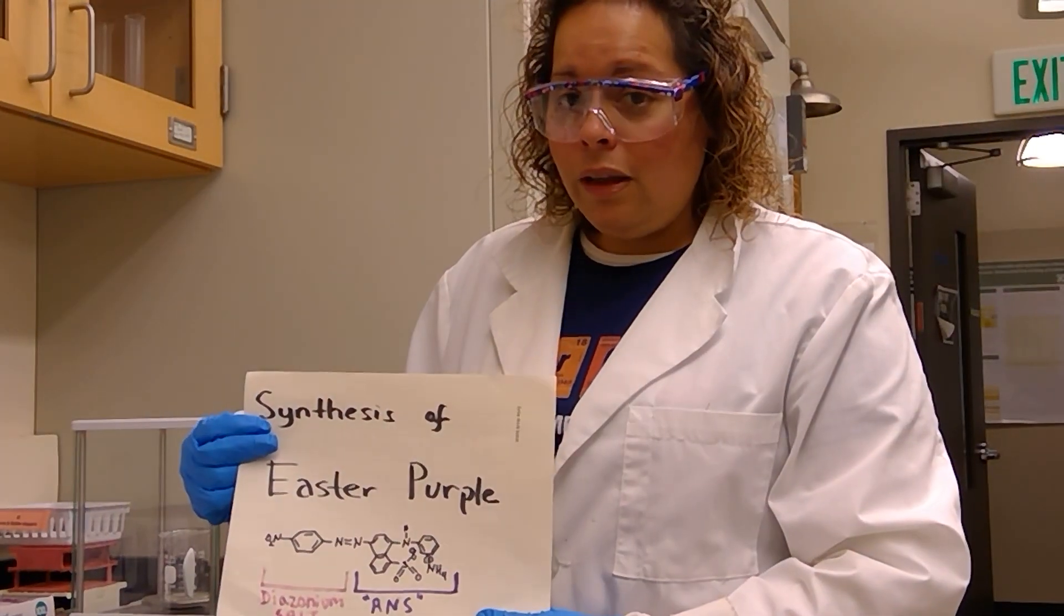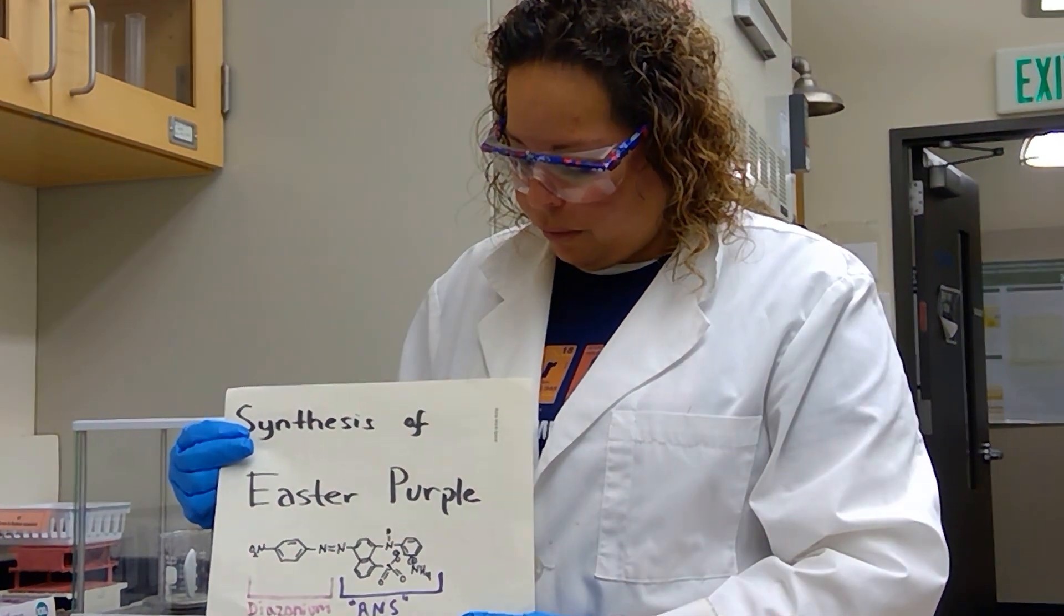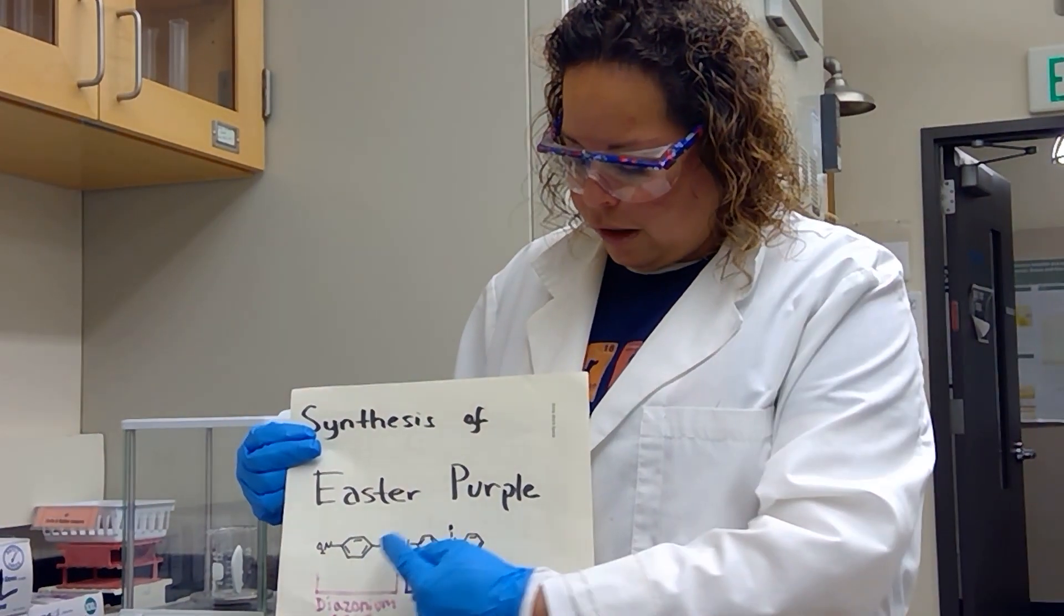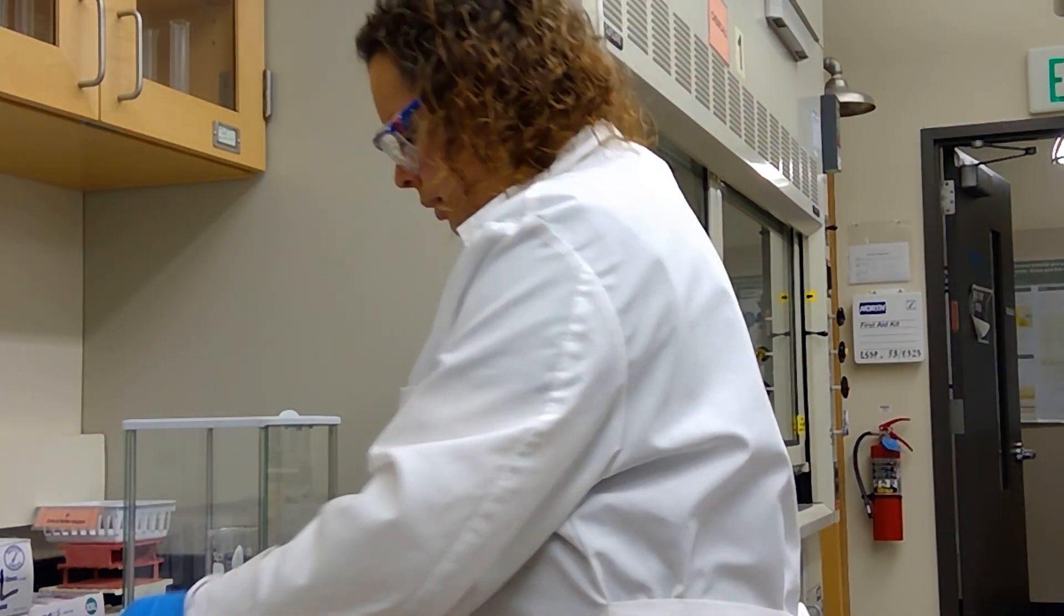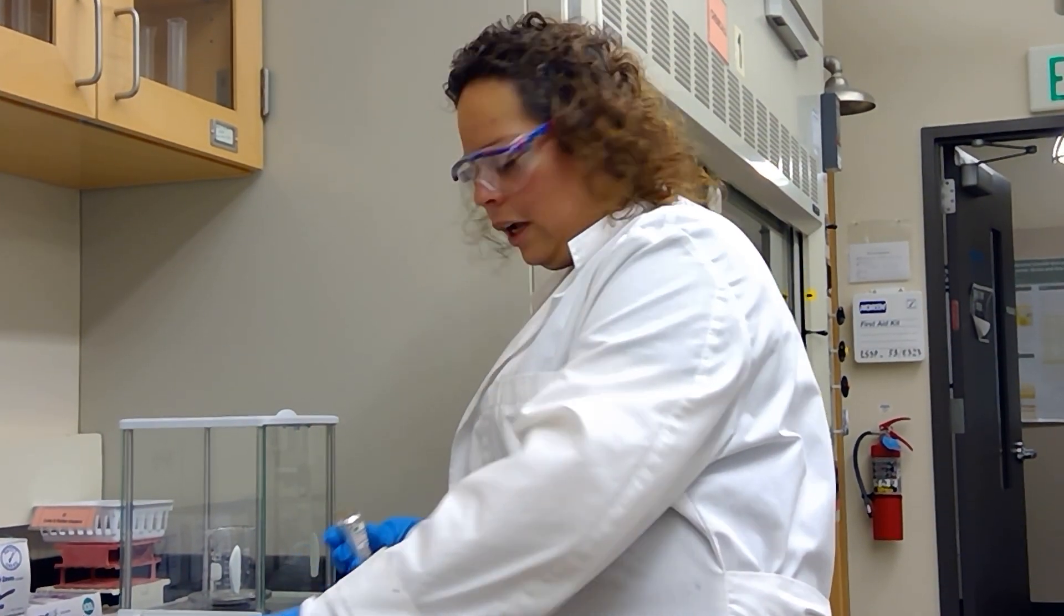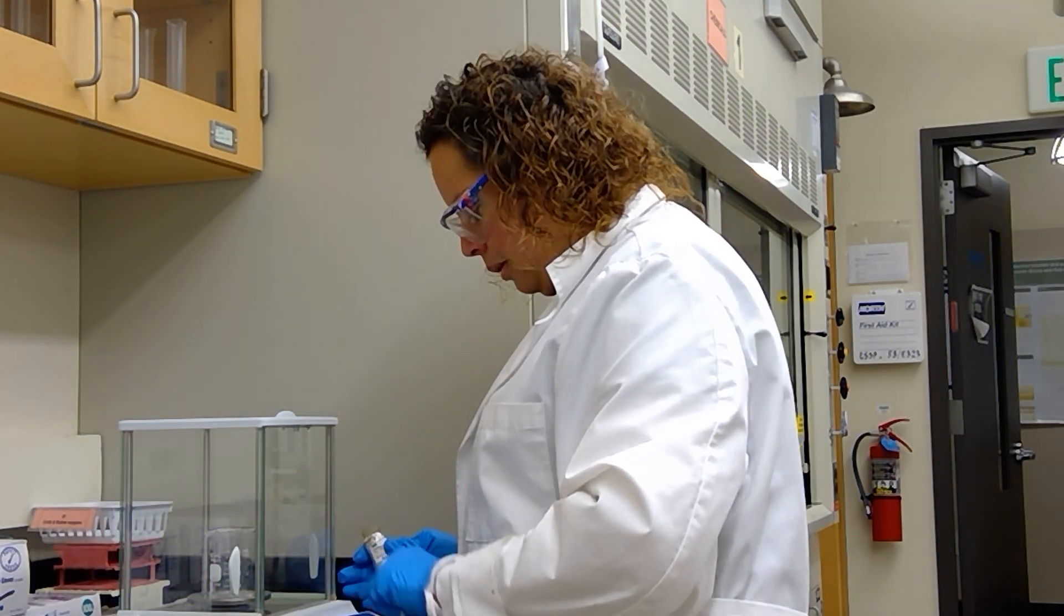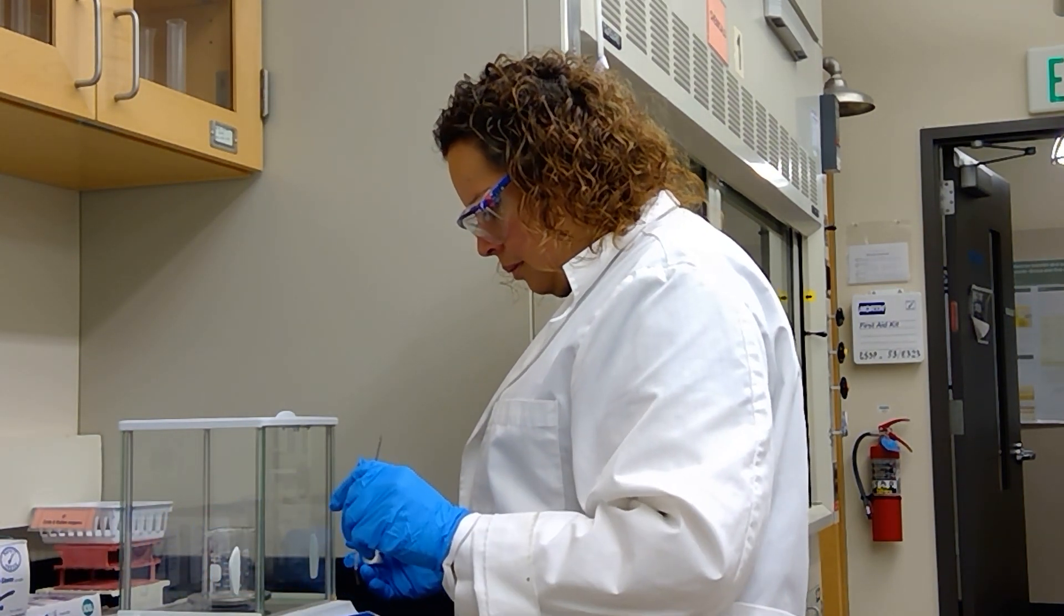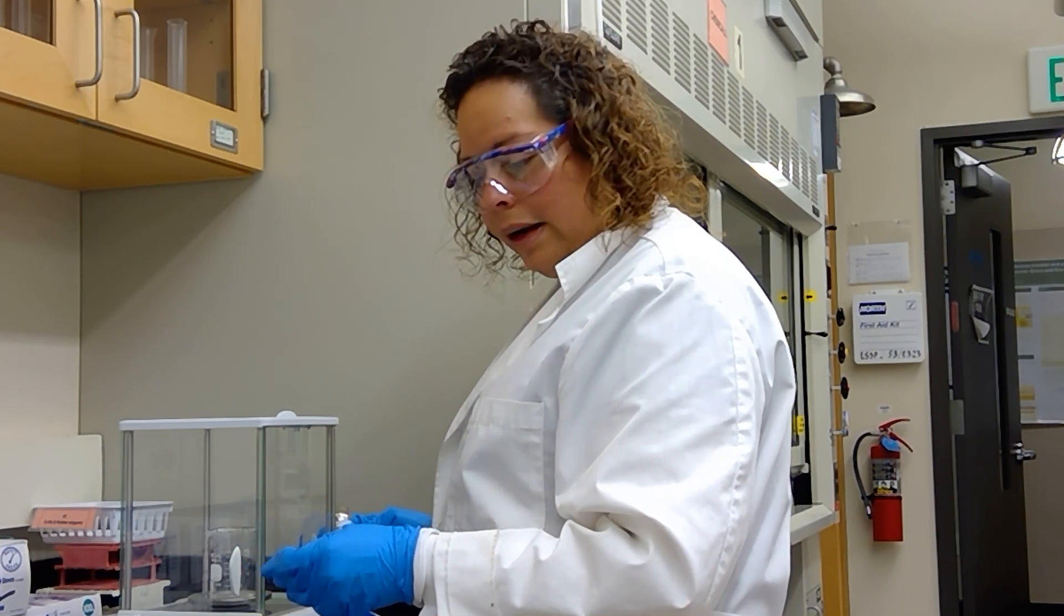Molecularly, we won't be able to see the structure once we have the solution made, but we will see the effects of the two compounds coming together on the fabric. All right, so I will measure my ANS molecule, and let me tare my beaker first, and I am measuring out 100 milligrams or 0.1 grams of ANS.